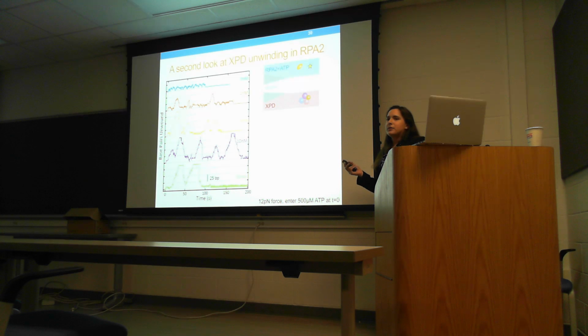And yes, all of the data I've shown you has ATP gamma S mixed with XPD for loading and in the Blink channel during movement. That includes the complex formation data.